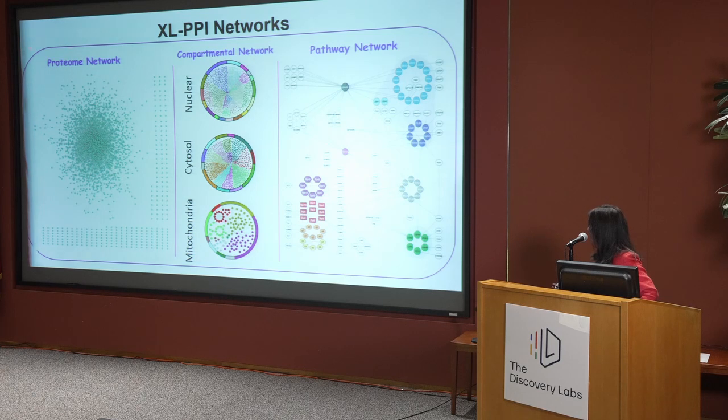And in addition to a global view of the proteome network, we can also define the compartment network, because protein-protein interactions can be spatially controlled. As shown here, from our data, more than 95% of the interactions actually belong to proteins within the same compartment.